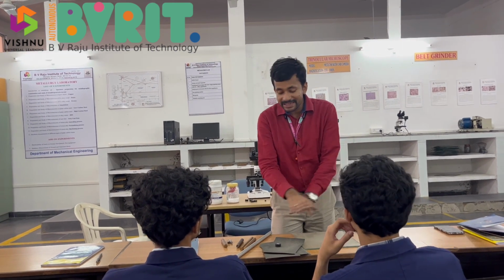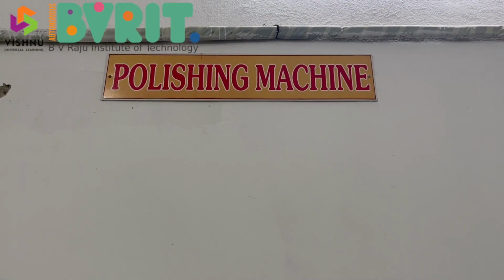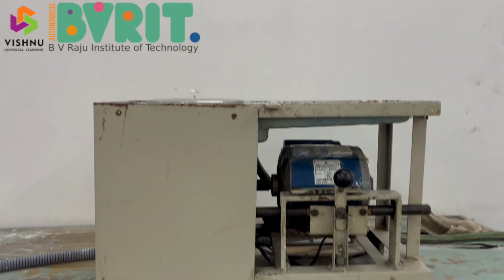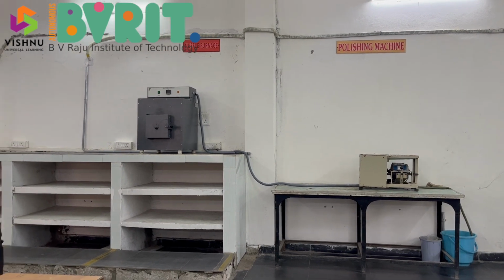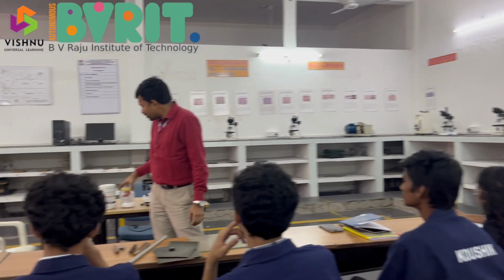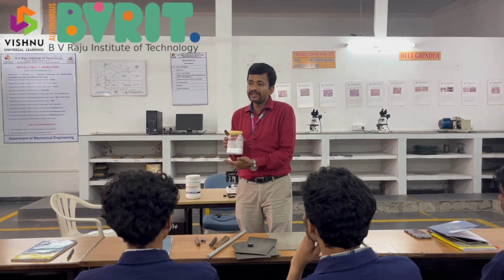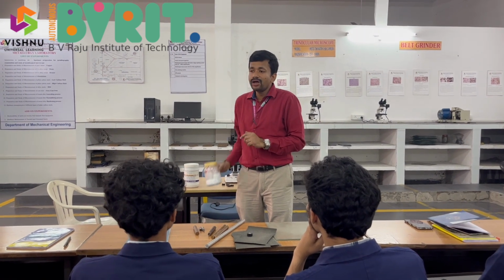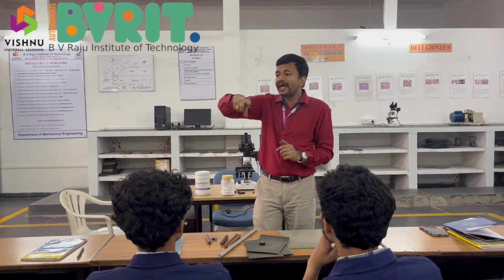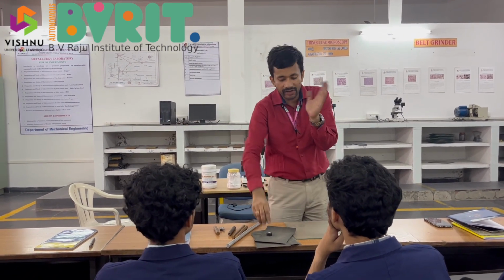Okay. Once these scratches are removed, then we are going to use this polishing machine, which is machine polishing. So manual polishing is done. Now we are going to use our machine polishing. In that machine polishing, you have a disc. So it is a disc polishing machine. On the top of the disc, we are going to use what is called alumina powder. So there is a slurry. There is water mixed with alumina powder, and this will be applied at frequent intervals, while rotating the disc. There will be a disc which will be rotating.